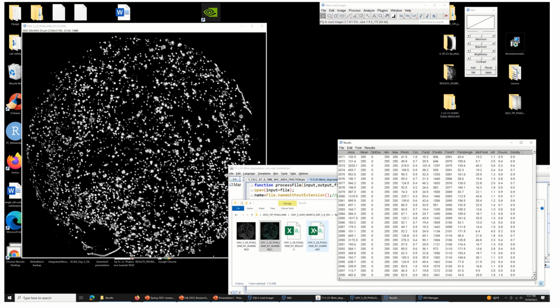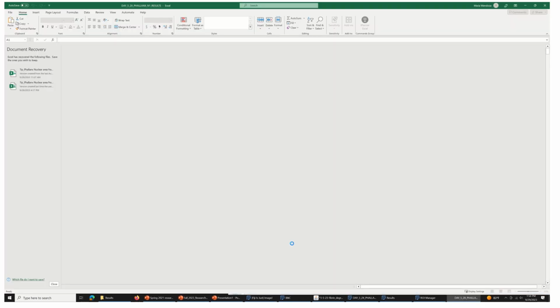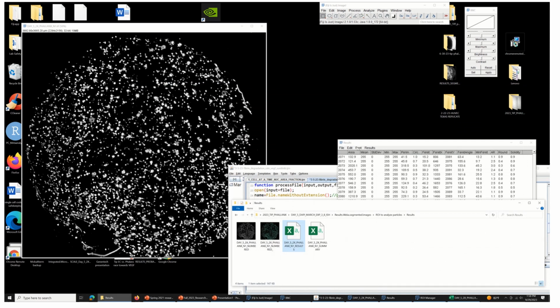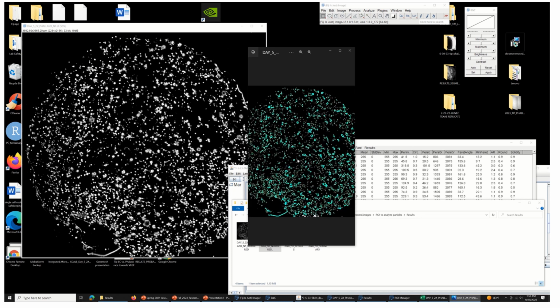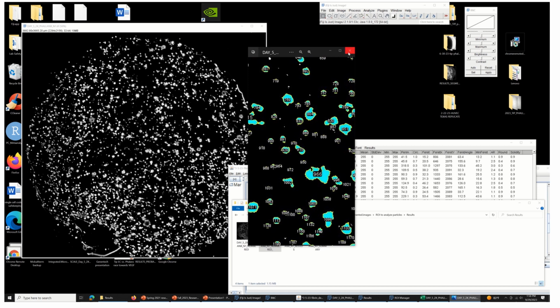And then you can see that this is an Excel file, so it's saved properly. I always like to open it up and double check, so yeah, that looks good. Make that small, and then we want to make sure that this actually saved as a JPEG, and that's when you can actually see your little numbers and everything.